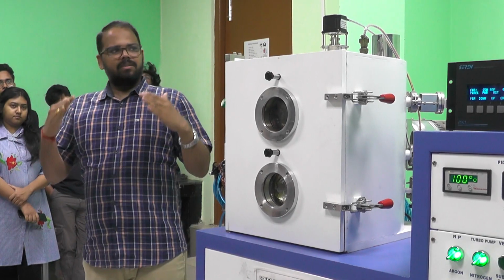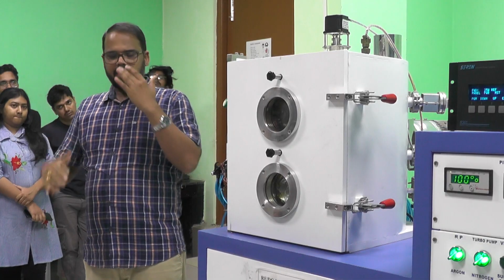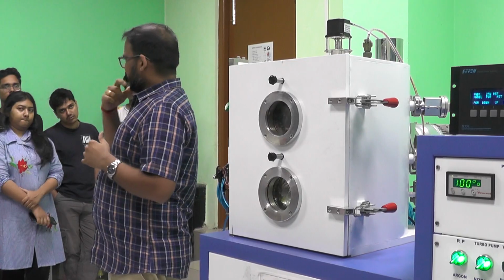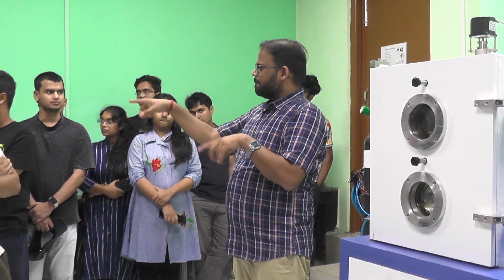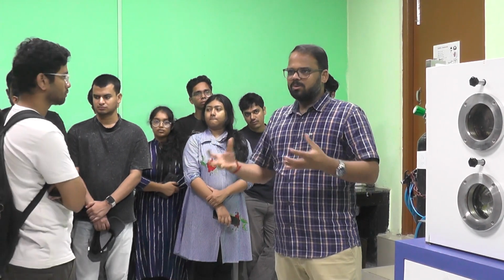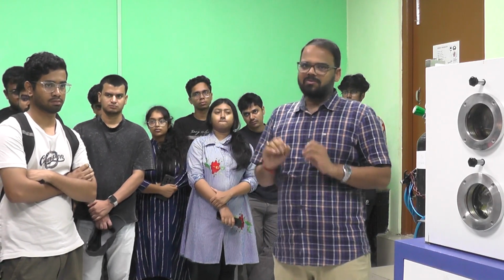In which way? We can show you just two sources and then the deposition and how it works actually. And along with that, you can see the thin film resistivity measurement setup which I discussed with you. So there the things are. You can have a look at how it is integrated, and try to discuss more. This session is specifically for interaction, so that you can be aware of that.